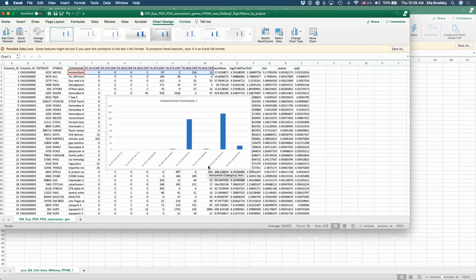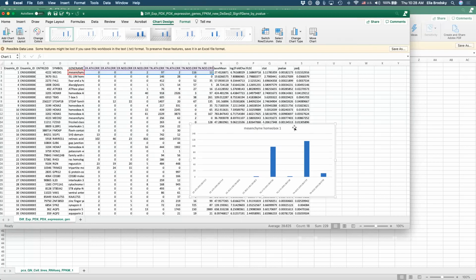And we have a fold change. What is the fold change? The fold change is if I take the average between these and divide it by, or divide these by these, doesn't matter which group by which, I will have a number by which I have to multiply the average to get to here, right? So that's the fold. How many fold is this one expressed higher than this one? It's this number divided by this. Okay, so here I can sort through.